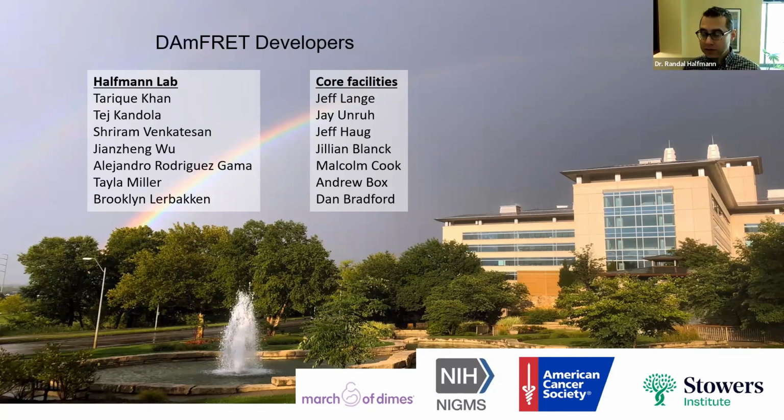And so the short answer in the case of TDP43 is we don't have any other evidence. But FRET is FRET, right? I mean, FRET is not lying to us. And we know that the molecules are interacting. We know that that's concentration dependent, and it has a tight concentration dependence, indicating it's a very cooperative species that's relatively large.